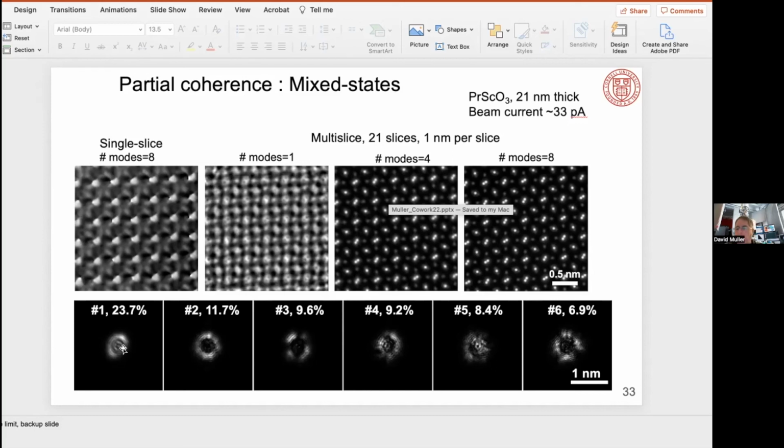The defocus stuff was one where I could now take advantage of position correction and tweak things up a bit more. I'd say our biggest issue is actually maybe not so much the random displacements, which definitely give you an improvement in resolution, but it'll reconstruct without. The thing that's the hardest for us is getting a consistency between the real space sampling of the pattern and when I'm trying to reconstruct from the Fourier space, because the beam drifts or the sample drifts, and that drift distorts the real space sampling. So you're not at the right position. And a lot of the drift correction stuff is actually correcting for sampling distortions in a fairly inefficient way. But getting those distortions sorted out matters, because if you don't, you get big inconsistencies. It'll reconstruct, but it won't look as good.